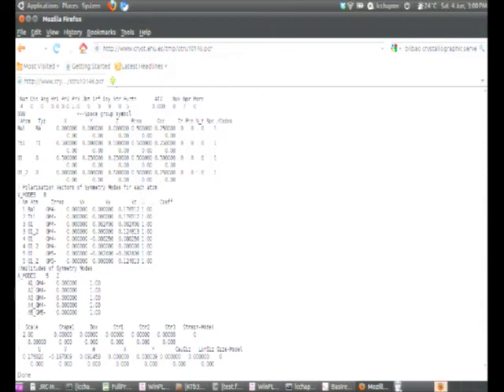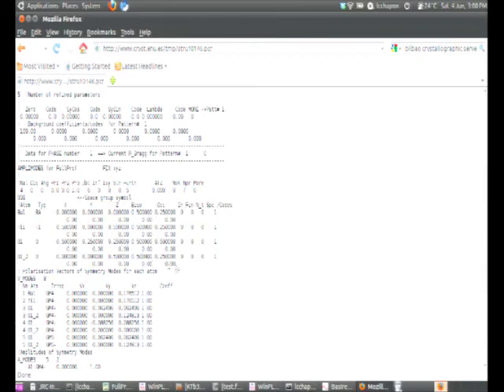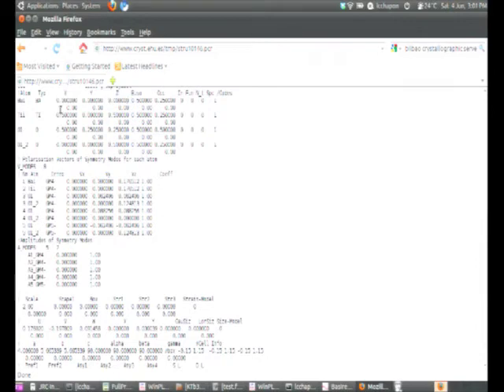And what you do in this case is that you refine, you can see here, the structure in its ideal high temperature cubic form, but instead of refining atomic positions, what you refine is the deviation from this ideal high temperature symmetry, with the different modes, which are normalized modes of the high temperature structure. This is extremely stable, in particular when you are very close to a phase transition. And I've seen a demonstration of this running recently from Manuel Garazmato.